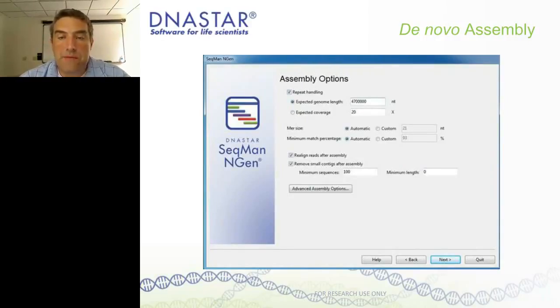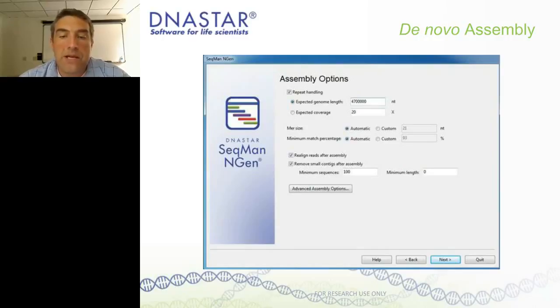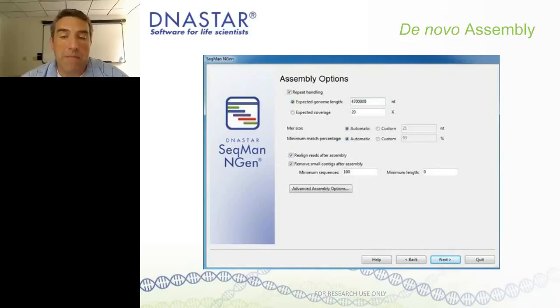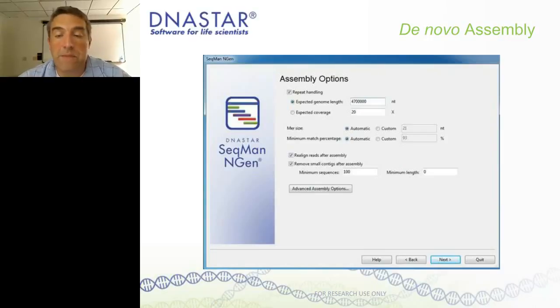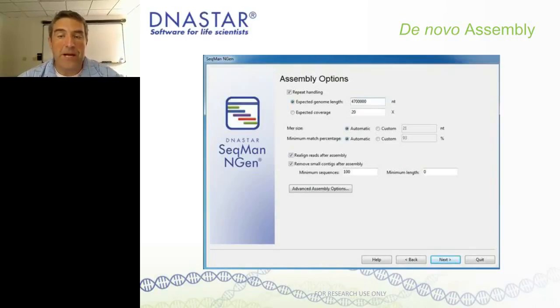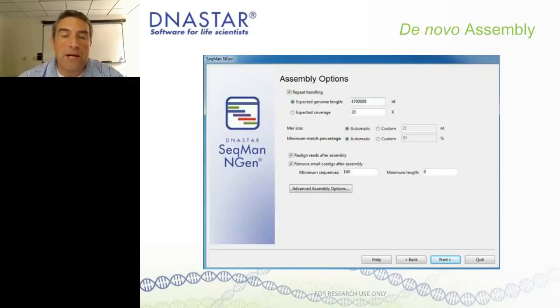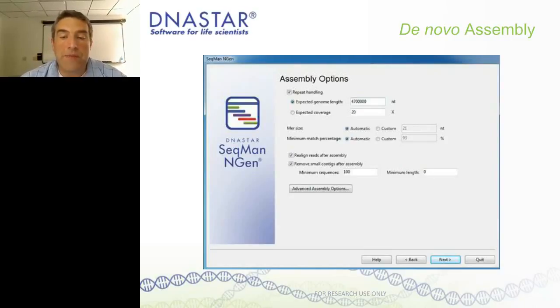Once we get to this point, we enter an expected genome length and set some additional options including minimum match percentage and MERS size. The minimum match percentage sets the overall stringency for the de novo assembly — it's the single most impactful parameter. For example, in a de novo assembly, if I change this from 93 to 83, reads will stick together that might not belong together, possibly producing bigger but inaccurate contigs with false joins. We find about 93% match for Illumina data is a pretty good balance — that's the aligned reads to the consensus for that contig.